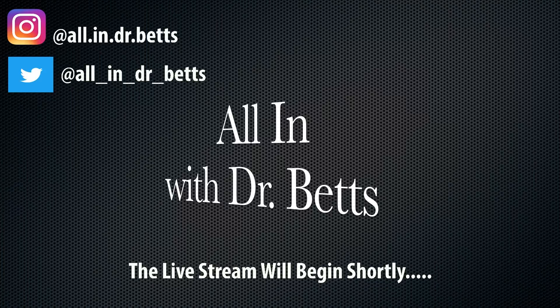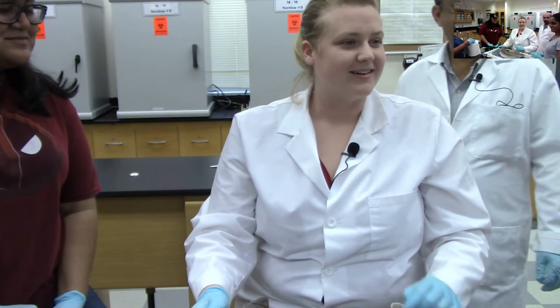A GoPro from a student's perspective. We already got one. I think he just wants as many angles as he possibly can. Go get the paper towel roll. Is he on live? You're not in that — the camera's right here. You can see what's on live. All right, Amber, you ready? I'm ready. You are going to go live. Are you going to step in here and actually say something? Yeah, I can.